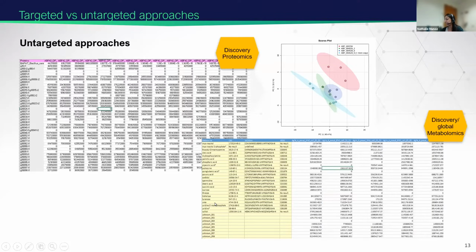We know this takes a long process, and we will explain both of these processes to get to the proteomics data and identified metabolomics data. But at the end, we just get all of these identifications, and in metabolomics, we even get unknowns for the features that don't have a good match in the library.